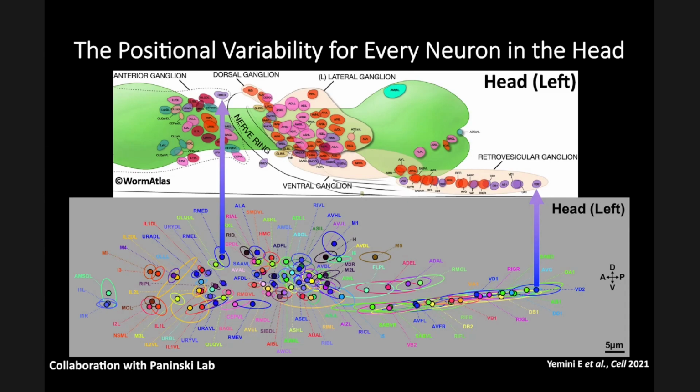We can rotate them, and I think we can even cause a little bit of shear, but we can't do anything beyond that. So we can't warp locally. You could say, okay, well, why not do local warping? But then, all bets are kind of off, right? Sure. Okay, makes sense.